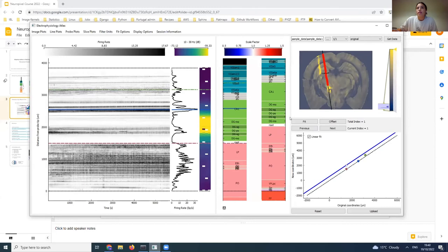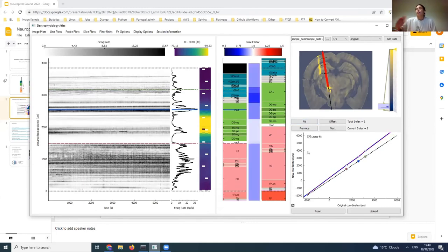And then apply a fit. After you've applied more than three lines, you'll notice that the electrodes are not only shifted but they're also scaled along the probe, according to the fit of the lines that you've placed, which you can see in this bottom plot here. And you can also see the fit that's been applied to the different regions in the central panel.